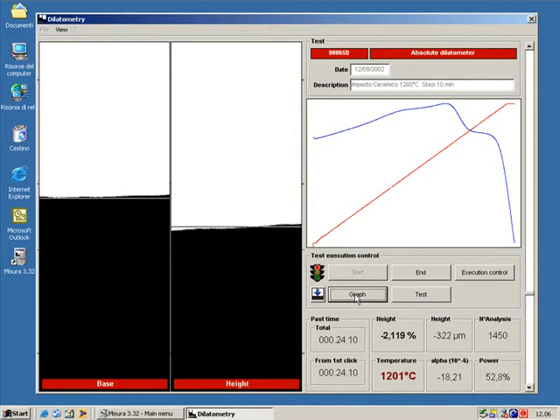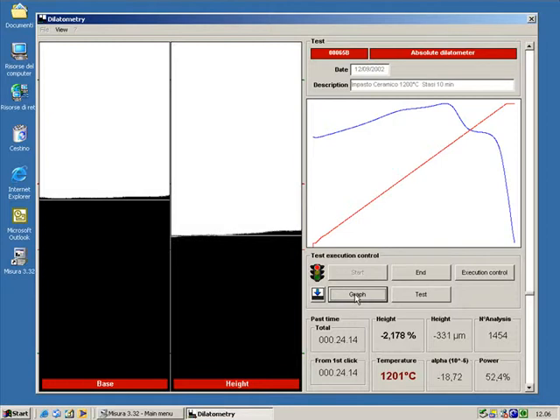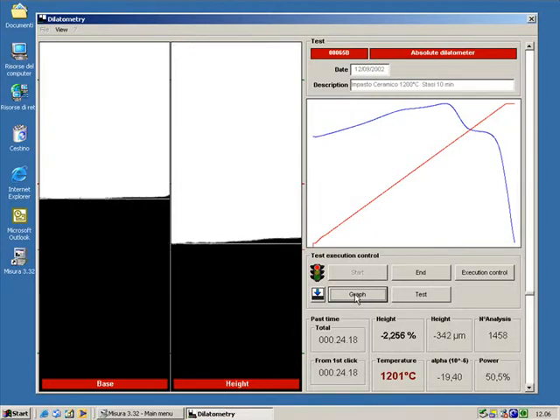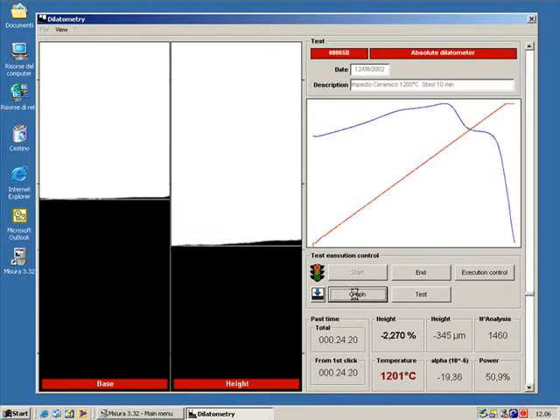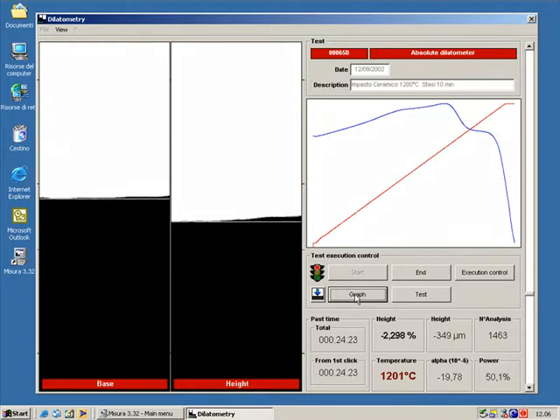The interval at constant temperature starts when the temperature reaches 1200 degrees C. Note that the temperature of the kiln overcomes by only one degree the set point.